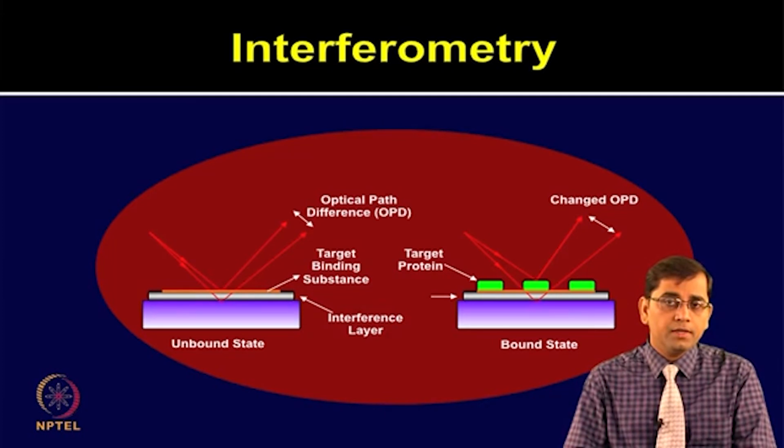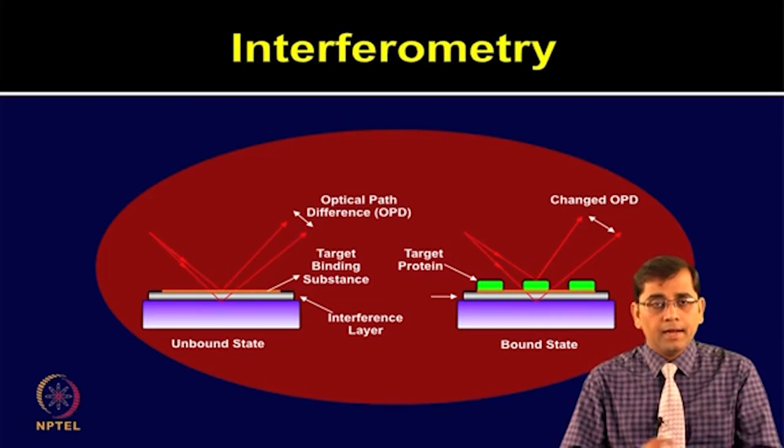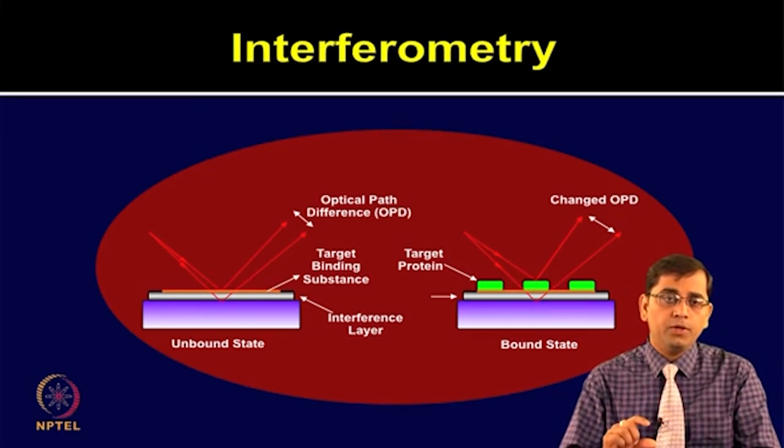In interferometry, the phase differences of wave fronts are transformed into observable intensity fluctuations, which are known as interference fringes. The interferometry techniques relate the optical phase to biomolecular layer density on the surface. The signal is created by additional phase shift or optical path length difference, which is caused by the adsorbate biolayer.